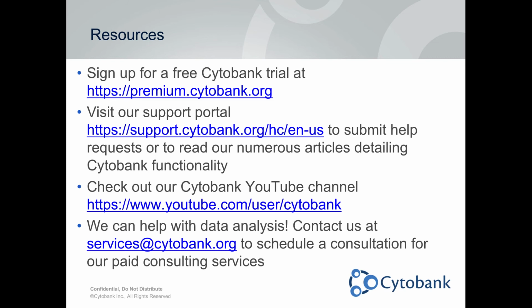Yes, I think it's a good question. I don't think the message was that Cytobank would do that for you. Cytobank is a combination of tools that you can use to do so. The main message is, rather than relying on manual gating based on the expression of different markers in a sequential gating, to rely more on, for instance, tSNE as a representative of dimensionally reduced data, which you can use to automatically identify your population based on density, which is perhaps still good enough, and go to the subsequent clustering based on tSNE to identify clusters within the Treg population, and then see how heterogeneous that population is and what you have there.